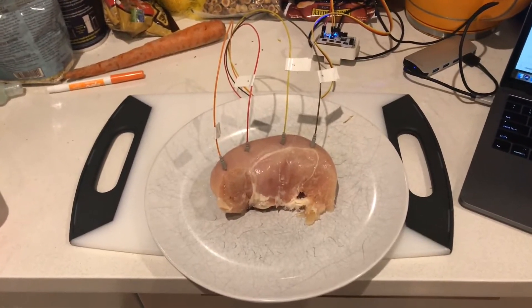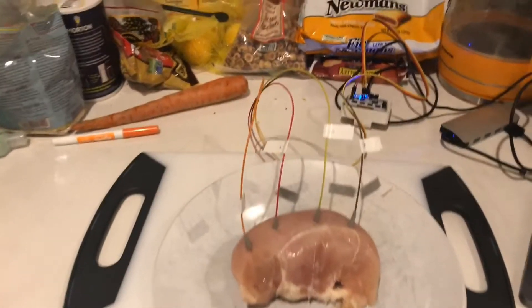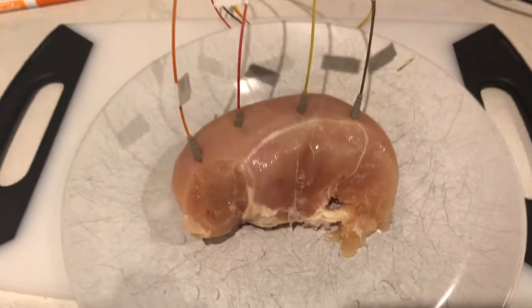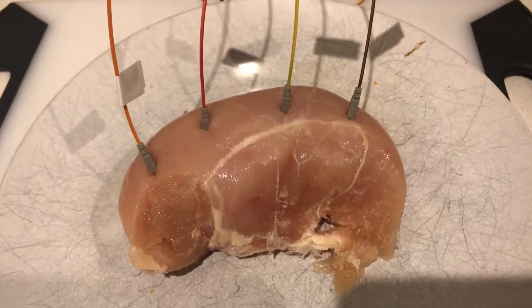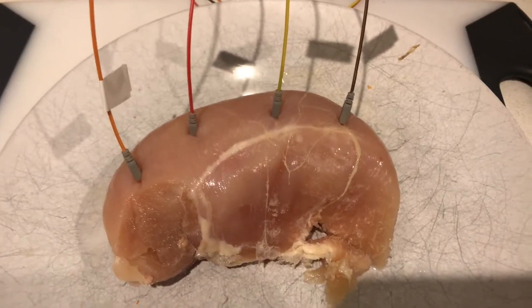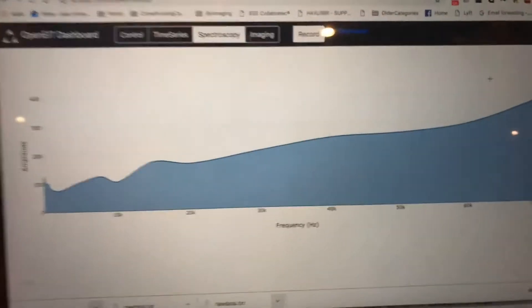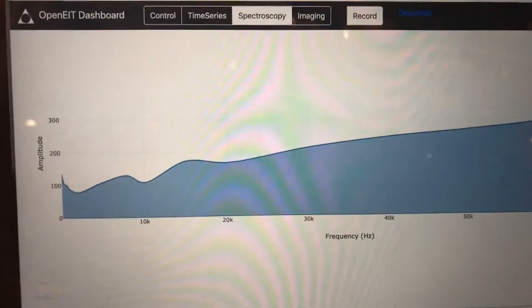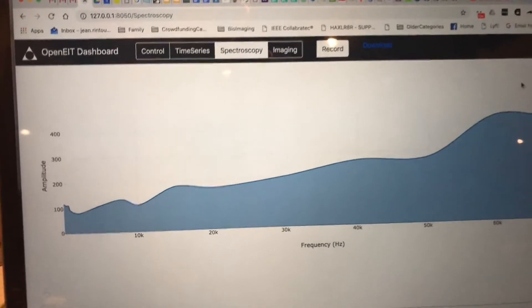Next up, we get the chicken breast out. We put our carrot off to the side. We have our current injection electrodes on the outer edge and our sense voltage electrodes in the middle, and we are then detecting a spectrum over here. Let's just zoom in — you can see the values, and it has a pretty unique spectrum going on too.